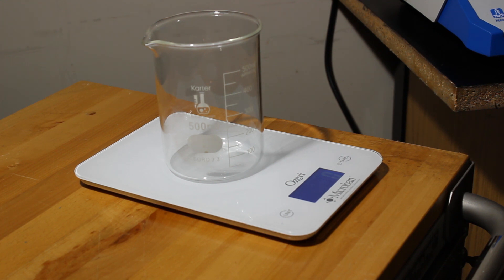Next is the sodium carbonate — it should be about 48 grams — and eventually we'll dilute that in about 200 mL.